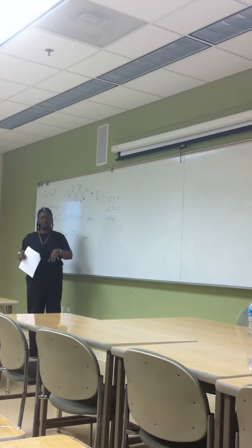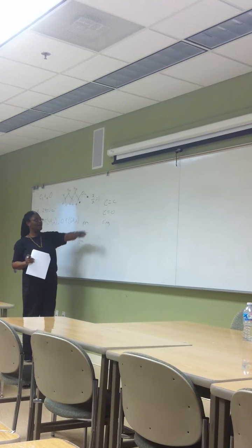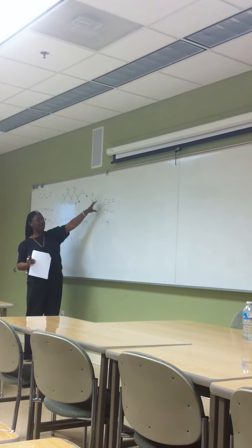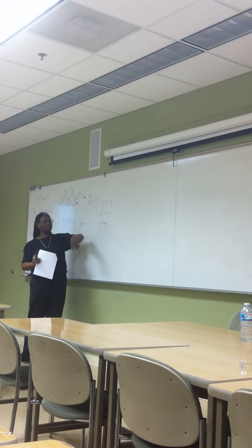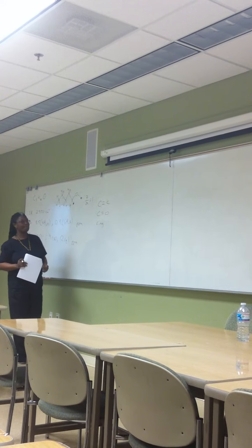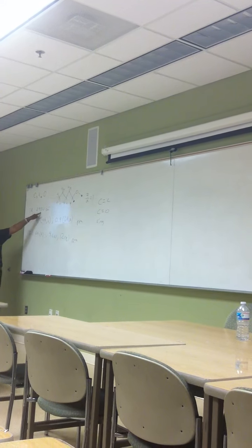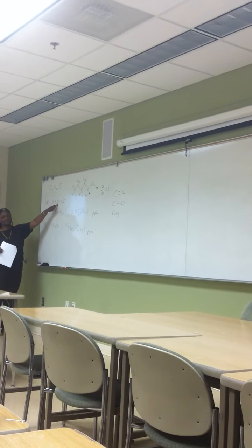Like I said, there's no specific order. You can look at what you want first. Usually I look at IR first because here now you can say, do I have IR structures that correspond to a carbon-carbon double bond or a carbon-oxygen double bond? Not that you gave us. And so for this problem, you don't. The only thing you have is 2950.